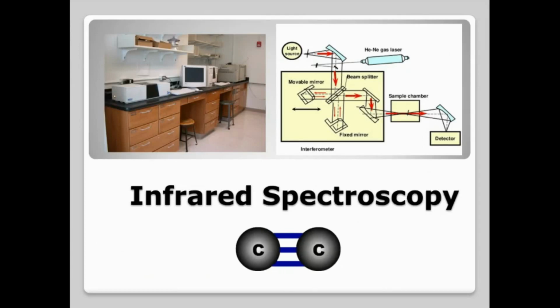It is not that I give the IR radiation and then the molecule is going to vibrate. No. Already all the bonds in the molecule are vibrating. Each bond will have a different vibration depending upon the dipole moment of the bond. If I have a dipole moment in the molecule, it will have a particular vibration, and that will generate electromagnetic radiation. That electromagnetic wave has to match with the IR wave which I'm giving from the instrument. If both match each other, the molecule will absorb the radiation and get excited. That is what IR spectroscopy is.